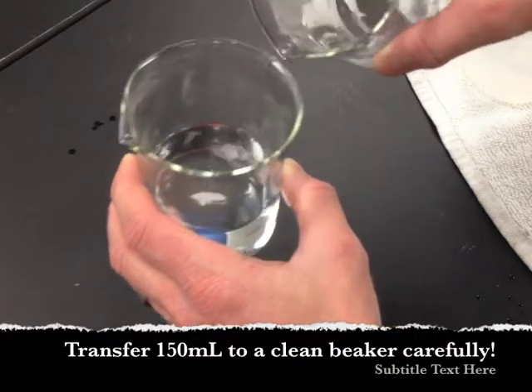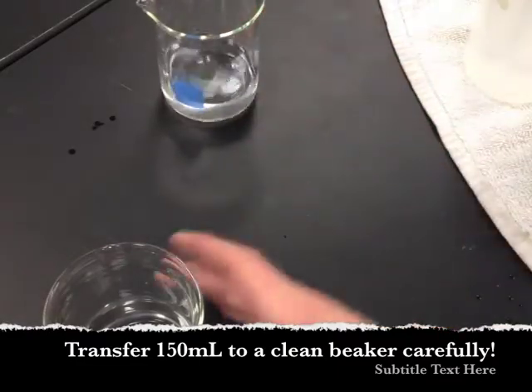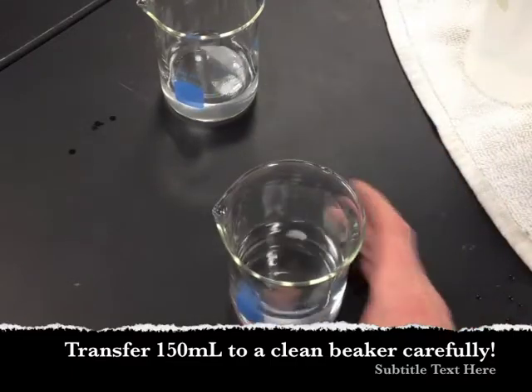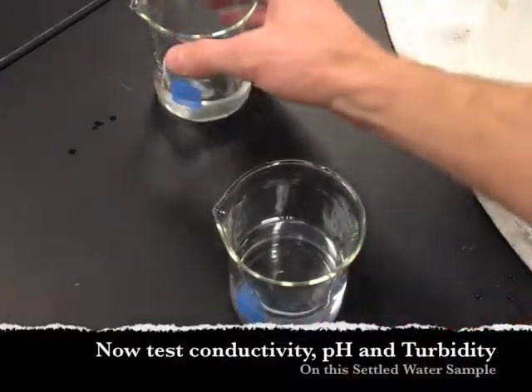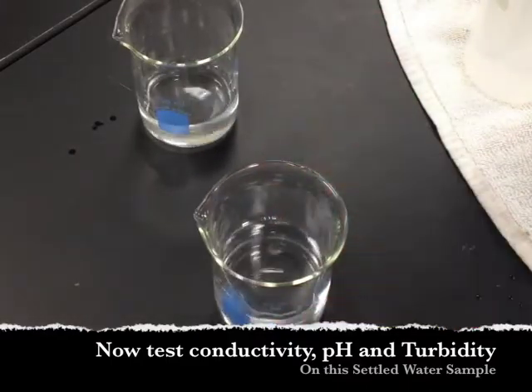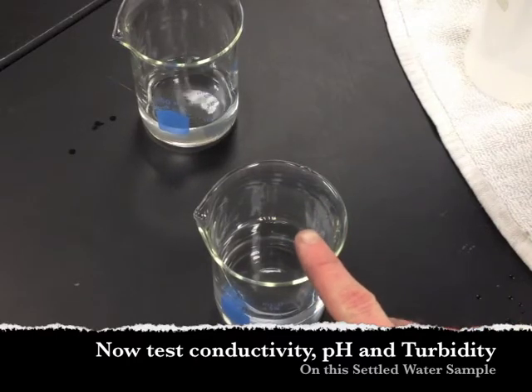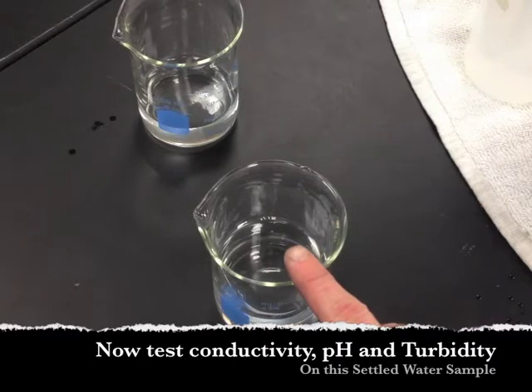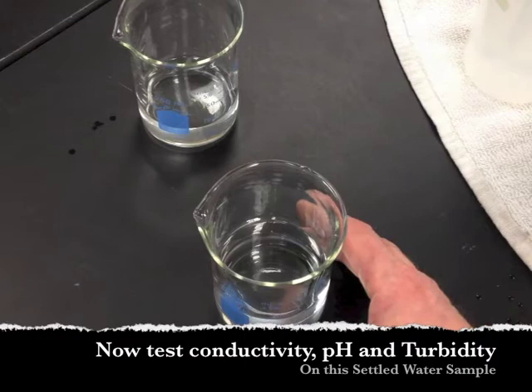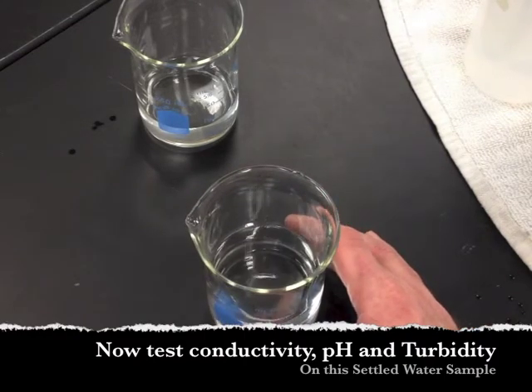Don't pour all of it, because some debris and sand settled out — leave that behind. Pour about 100 to 150 mL — don't pour the entire 200 mL, as that would pour everything and you'd have to resettle it. Now do all three readings — turbidity, conductivity, and pH — on this settled water sample.